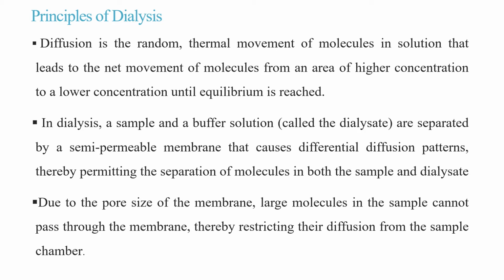Due to the pore size of the membrane, large molecules in the sample cannot pass through the membrane, so their diffusion from the sample chamber is restricted and they can be easily separated.